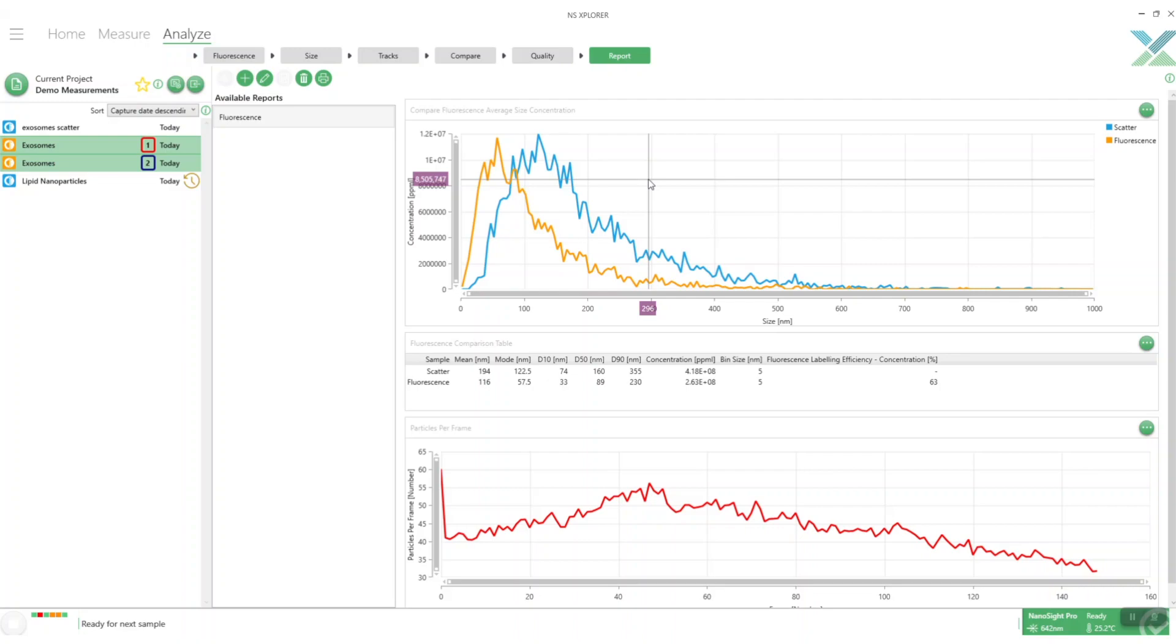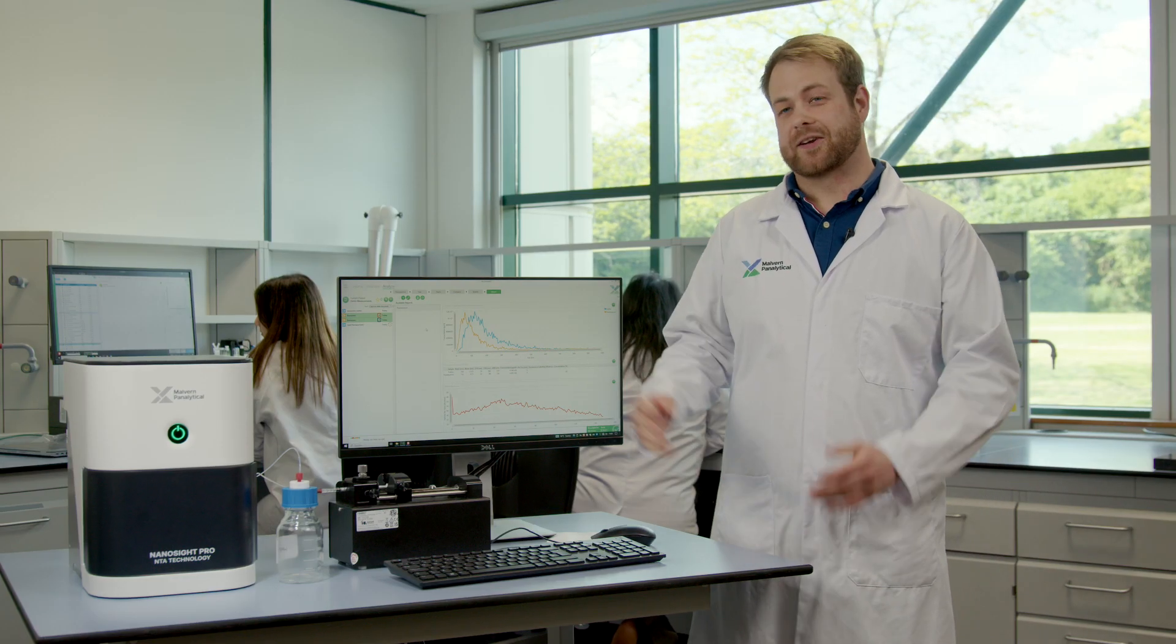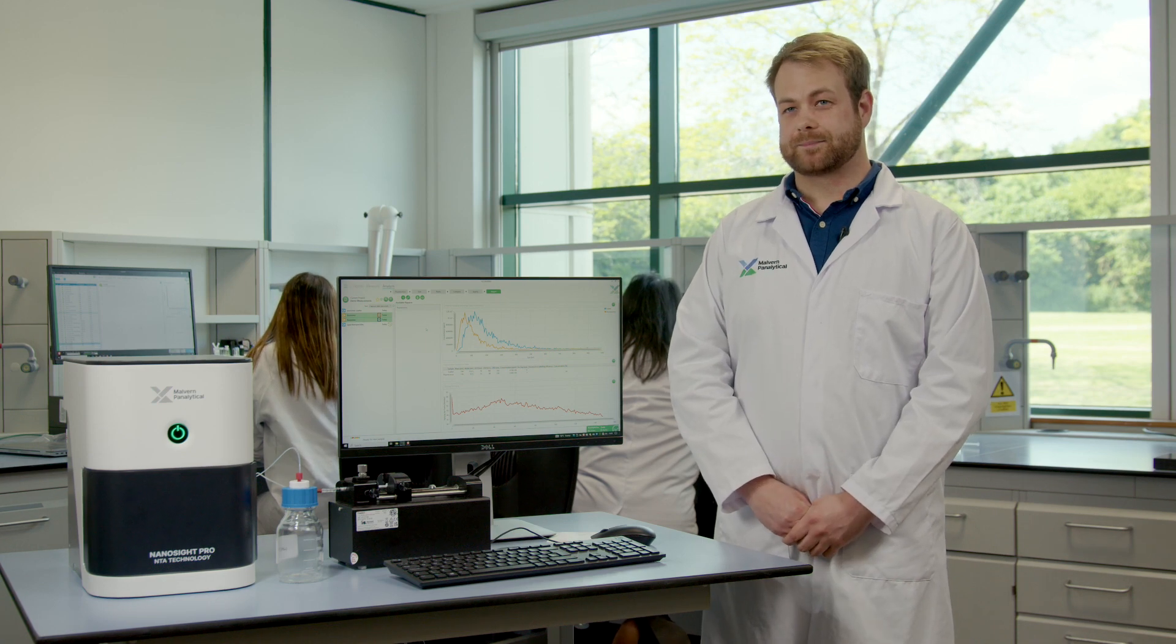That's the end of the demo. I really hope today you've been able to see how quick, easy and accurate the new Nanosight Pro is and I really hope you've enjoyed it. Today we've looked at exosomes but it's also really versatile and can be used for other nanoparticles and bioparticles such as nanobubbles, lipid nanoparticles and viruses. If you have interest in any of these applications then please contact your Malvern Panalytical representative.